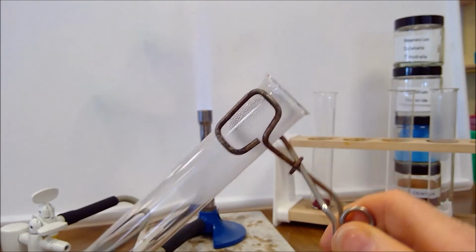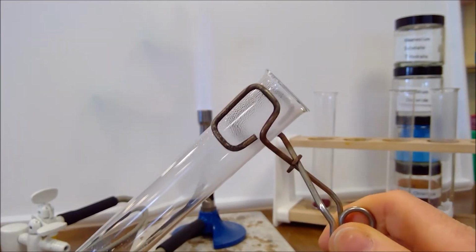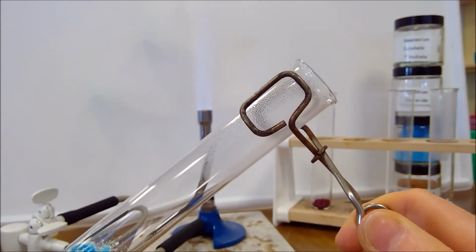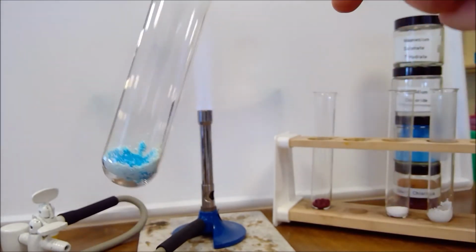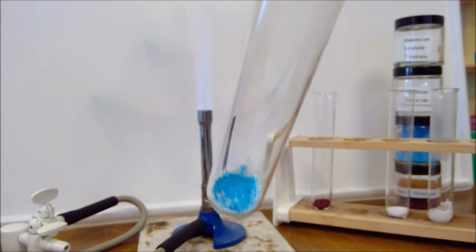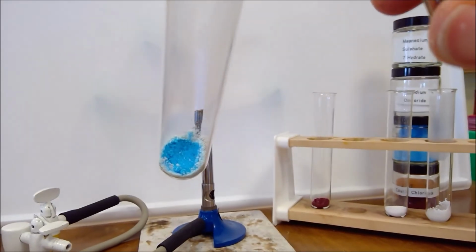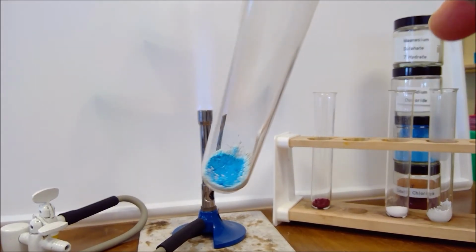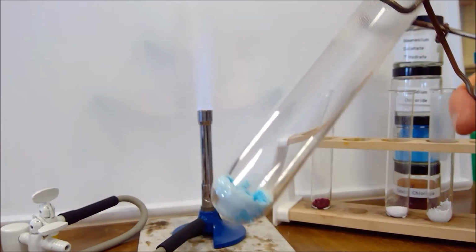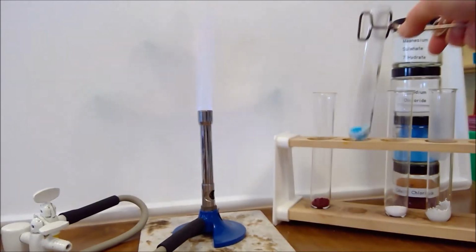So this one, I don't know if you can quite see, I can see lots of steam coming out the top, and we can really make out the condensation at the top of the tube there. Then, the solid around the outside is getting the most of the heat, so it would take a little longer to get the change all the way in the middle. So for the end appearance, we observe more the solid around the outside there.